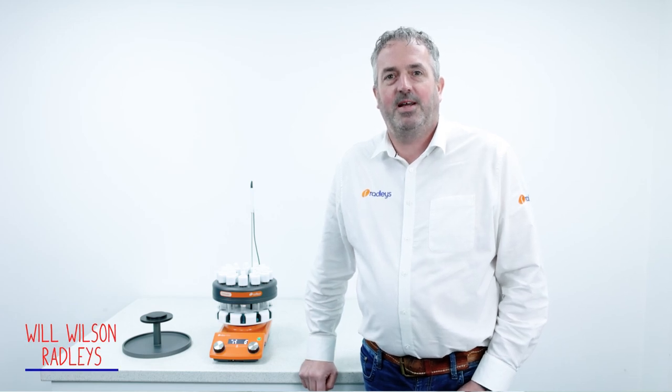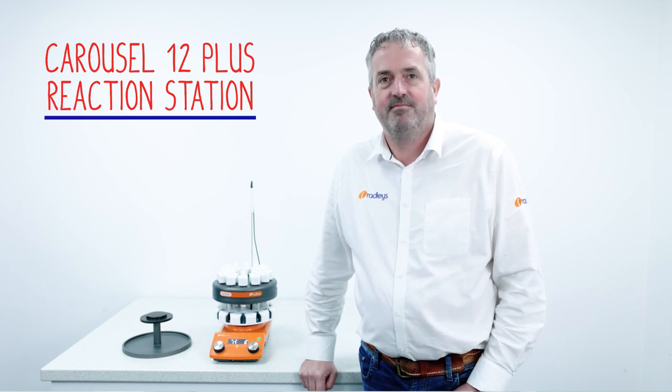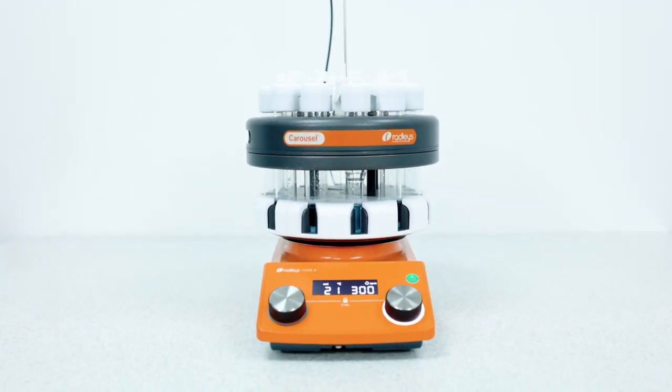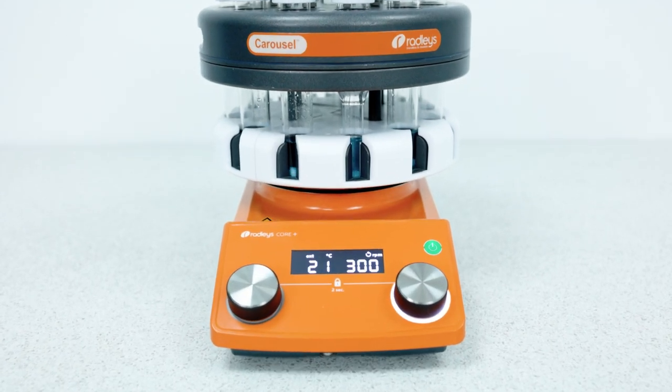Hi, I'm Will, part of the team here at Radleys and I'm going to give you an introduction to our Carousel 12 Plus Parallel Reaction Station. It has the ability to magnetically stir, heat or cool up to 12 reaction tubes simultaneously while still maintaining an inert atmosphere.